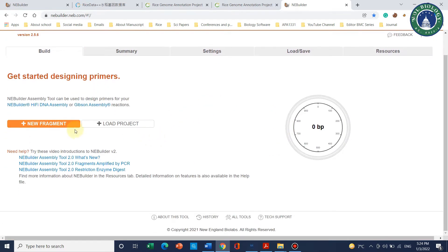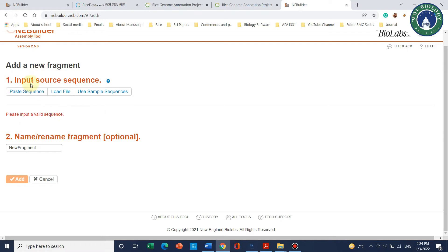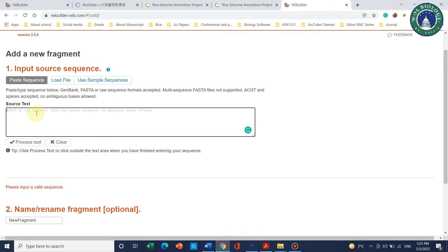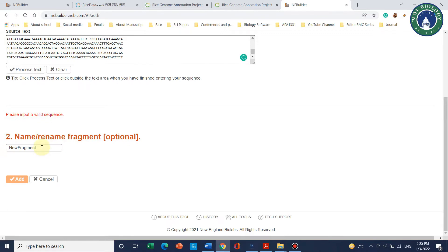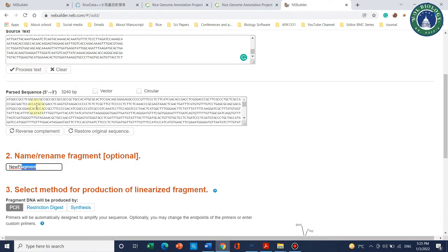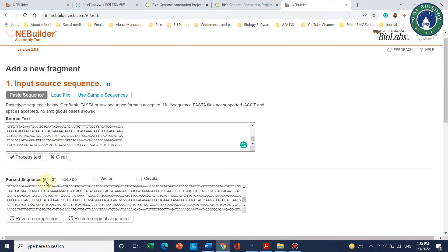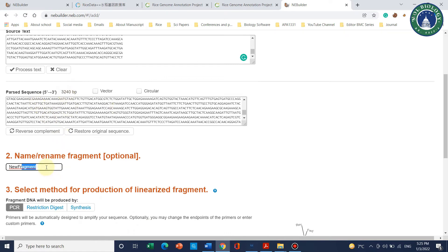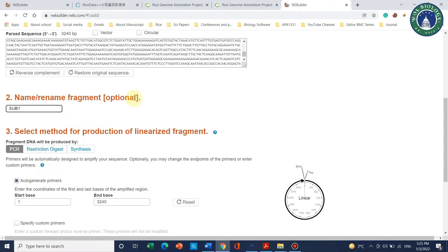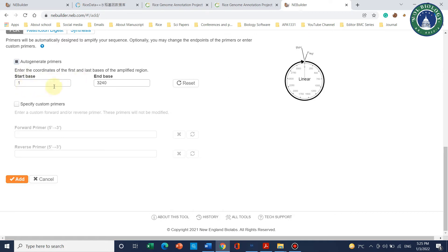This window will appear. Click on 'New Fragment' and it will give you an option to add a fragment sequence. Click on 'Paste' and paste the first part of the sequence. Here you can write the name — since this sequence is already 5-prime to 3-prime we will not change the orientation. We will name this fragment 'Sub Part 1'. It shows the fragment starts from base 1 to base 3240.